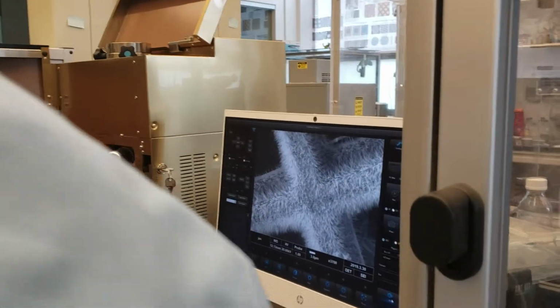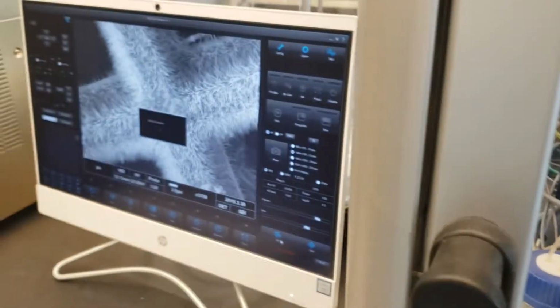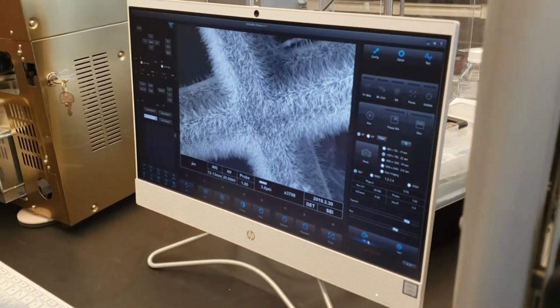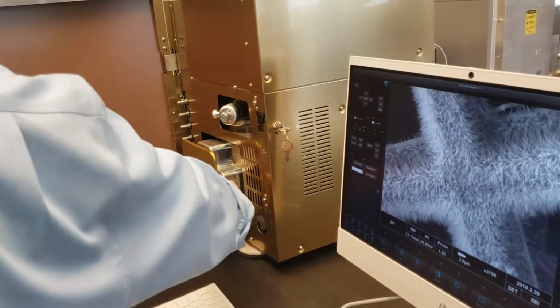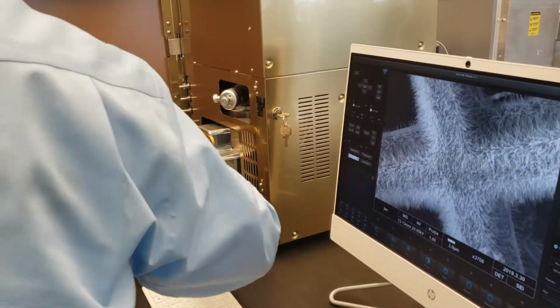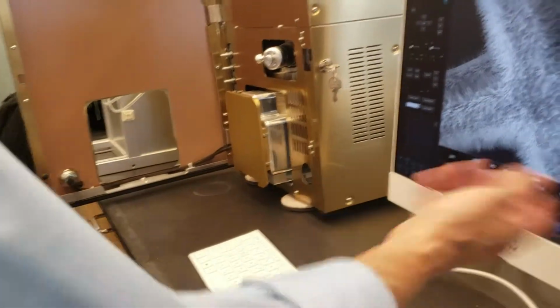This little blue light just became active for us to pump down, to evacuate the system. So I just click on it, and it's going to start evacuating, and I just hold the door closed a little bit, and then you hear that second sound, that's when it opened up the valve and exposed the rest. Now I can't open this door, it's closed, and now it's just pumping down on its own.